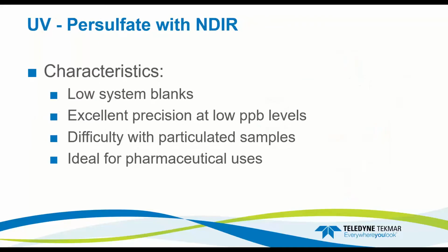So what are some of the characteristics that we're looking for in this type of analysis? Within the pharmaceutical realm, we're going to be utilizing a UV persulfate. UV persulfate is the system of choice when it comes to ultra low level, clean water samples that will be facing or coming across in the pharmaceutical market or pharmaceutical field.